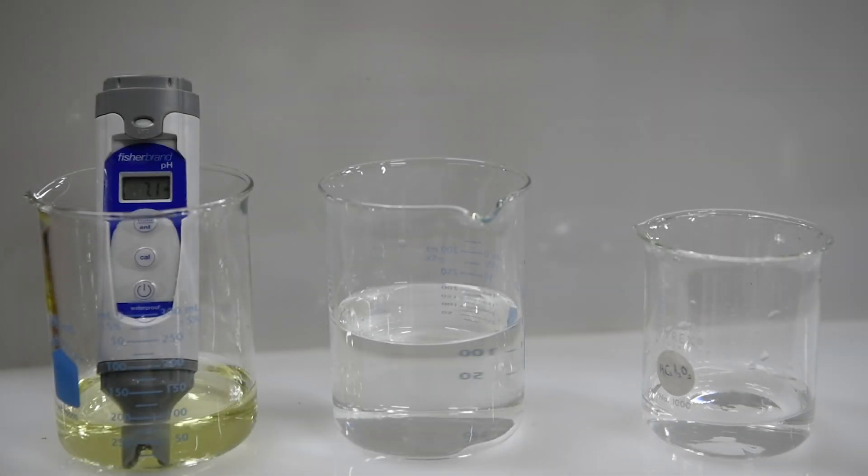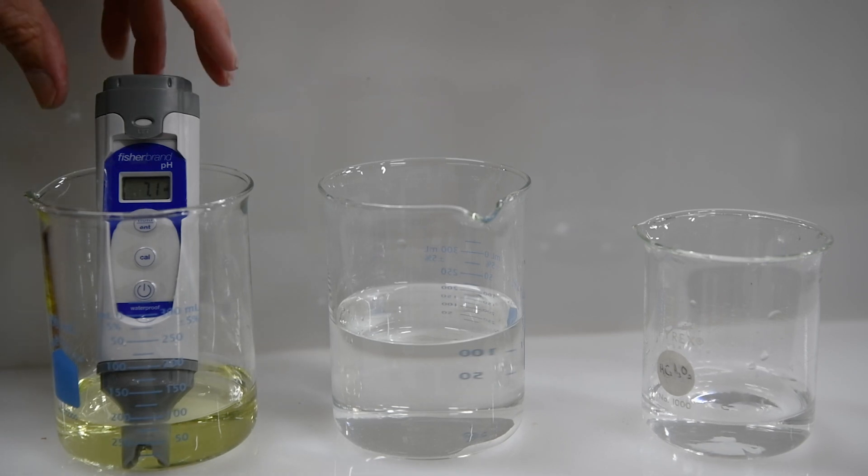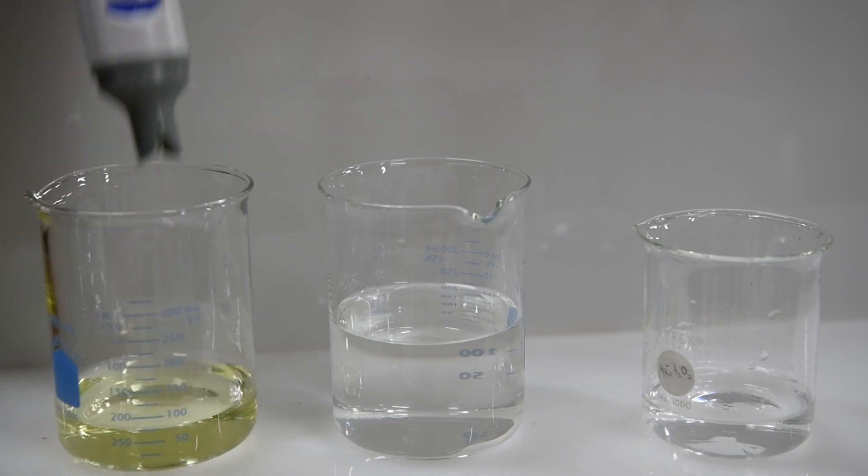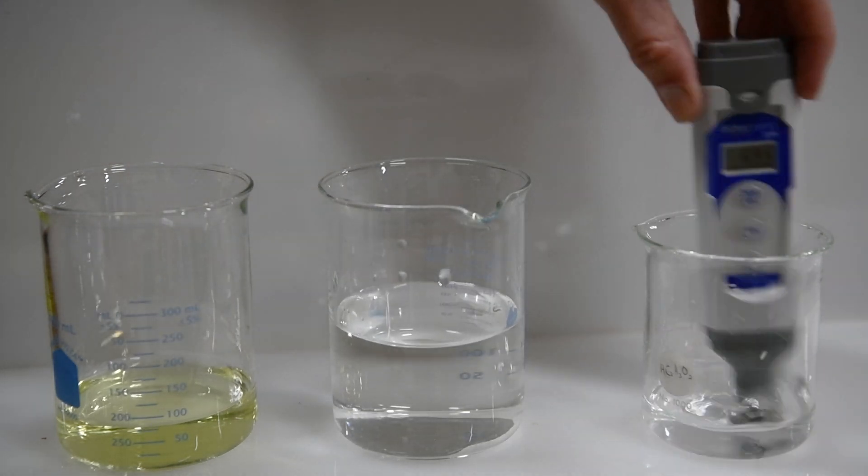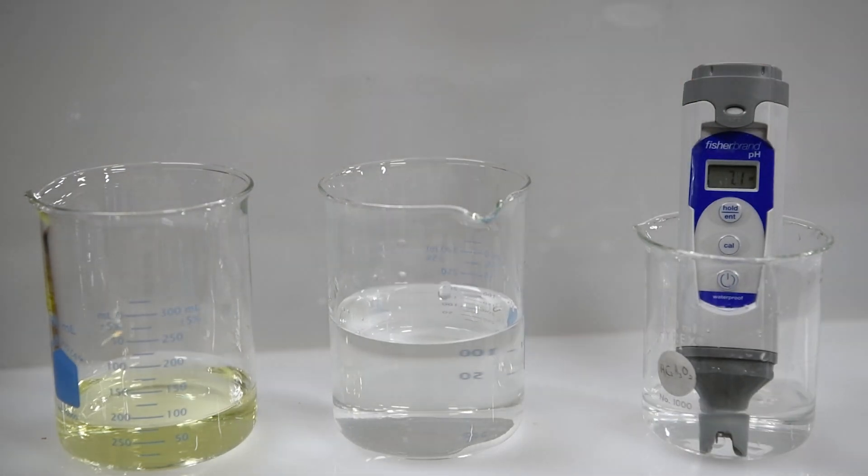All right, our next sample will be a sample of sugar, which I've dissolved in a little bit of water. So we'll rinse off our probe and put it into the sugar water solution. And it's got a pH, it looks like, of about 7.1, 7.2, so pretty close to neutral.